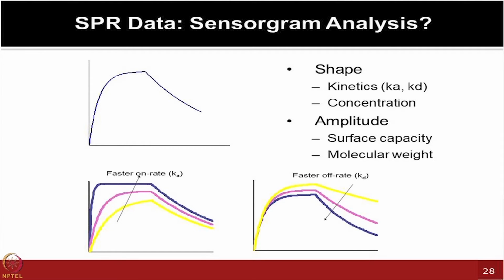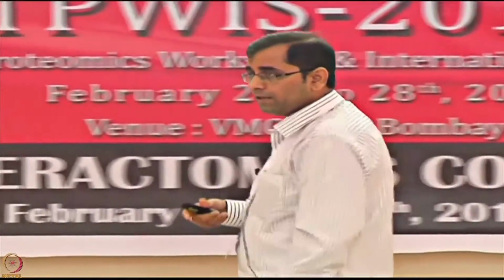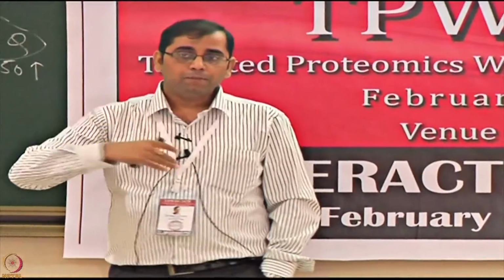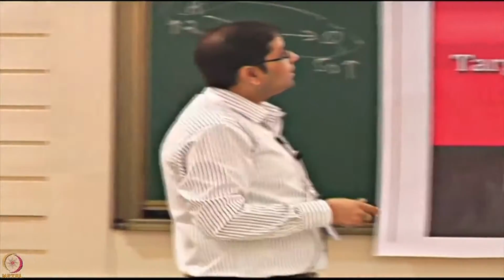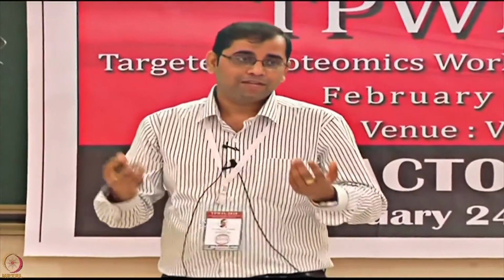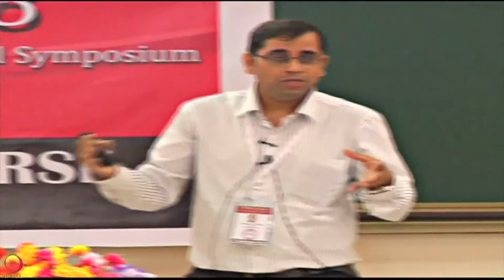So therefore these kind of curves are very crucial as you are watching, and there are many companies who work with us, who do the testing in our labs, in our facility, who are trying to look at many of their biosimilar products and some of these kind of testing they do. We can see from their experiments that just looking at the shapes of these sensorgram curves can make them feel excited or not so excited, because immediately it tells them it is working or not working. So all of this is just visually what you are seeing.